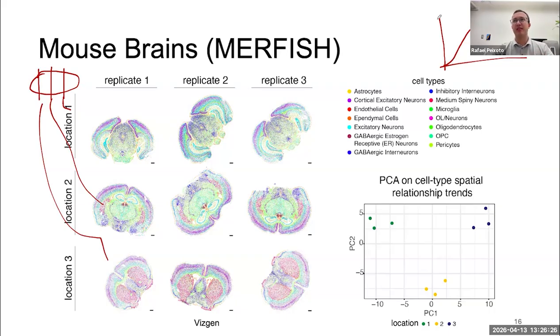There were many other ways of doing it, but what we did was calculate the area under the curve. If it is a colocalization, we have a positive area under the curve. If we have a negative relationship, we'll have a negative area under the curve.